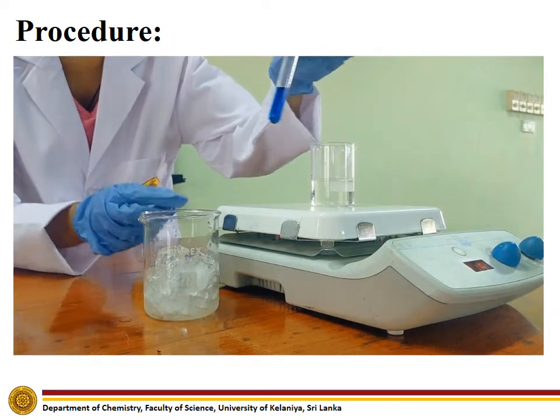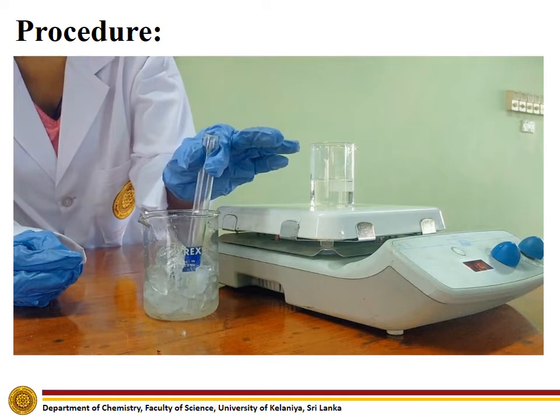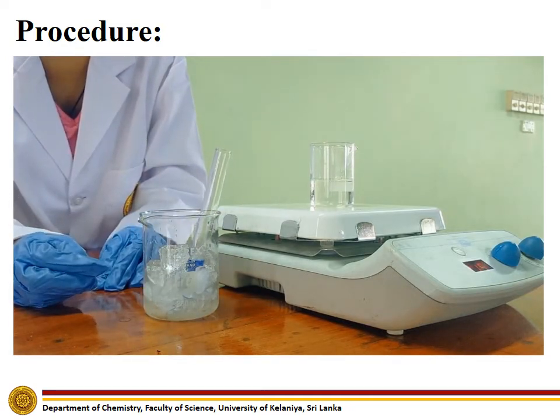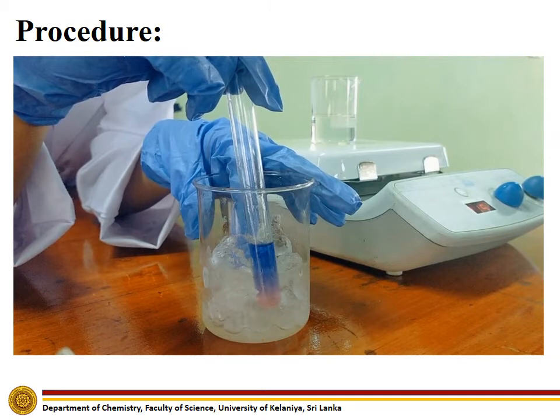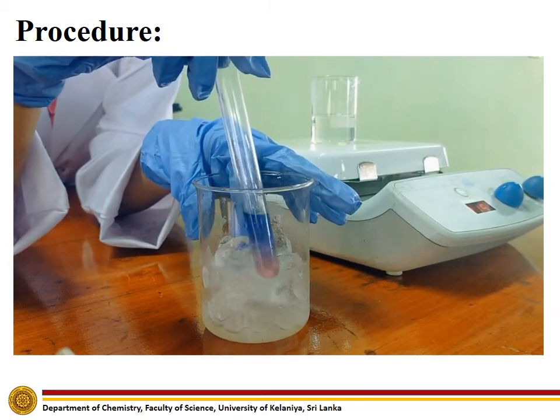Next, place the test tube in a beaker containing ice and note the observation. After few minutes, the blue color has changed to pink.